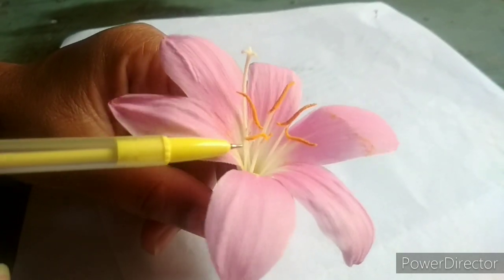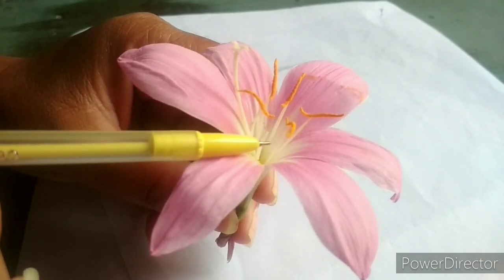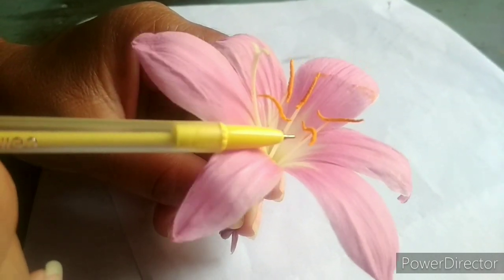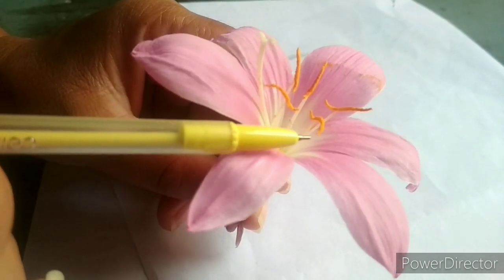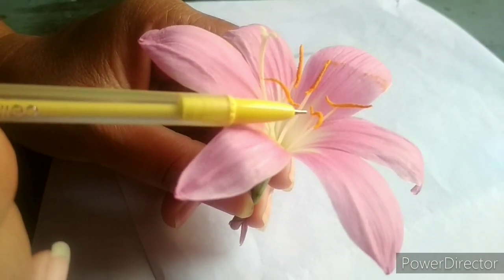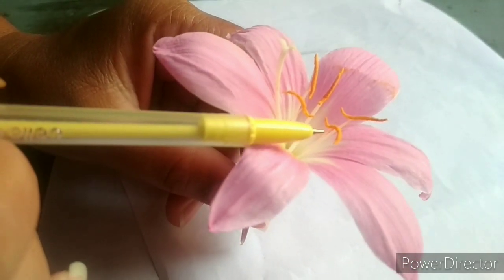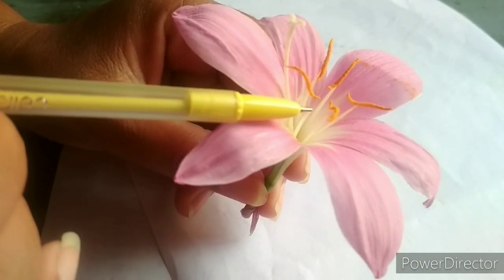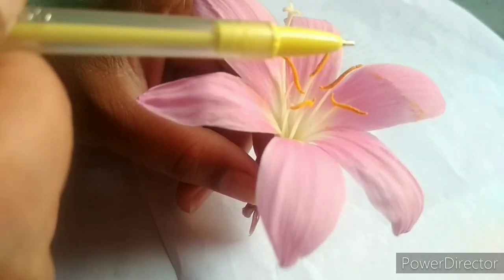After the outer part, we see the inner parts. There is a thin white stalk and a yellow colored top — that is known as the stamen. The stamen has two parts: the white colored part is known as the filament, and the yellow colored top is known as the anther. The main function of the anther is to produce pollen grains. The yellow color that you see — those are the pollen grains, and pollen grains consist of male gametes.